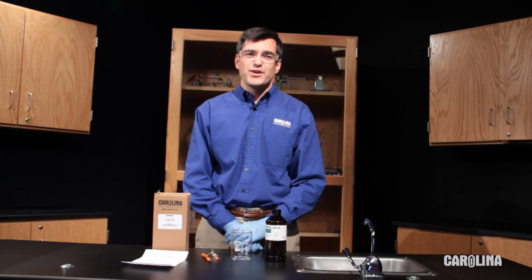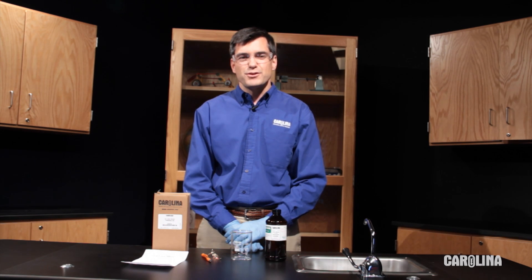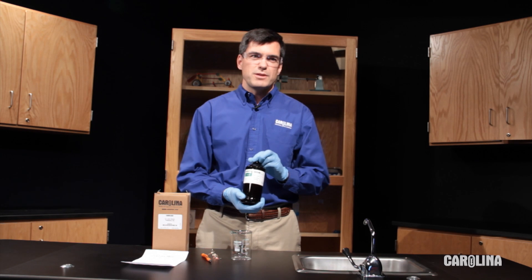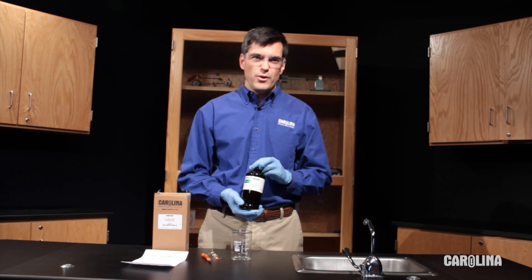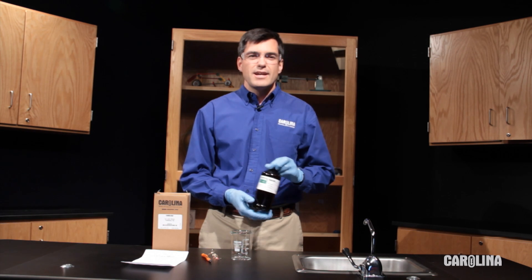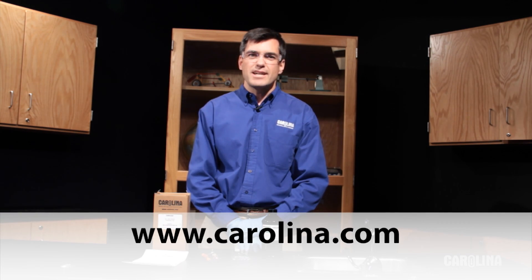As we've seen, silver ion oxidizes copper and copper ion oxidizes iron. This kit contains enough materials to do the experiment five times. Be sure to keep the silver nitrate bottle in the dark or wrap it with foil, as light can reduce the silver ions to elemental silver. Carolina offers other experiments for performing reduction oxidation reactions. Visit www.carolina.com for this and other experiments.